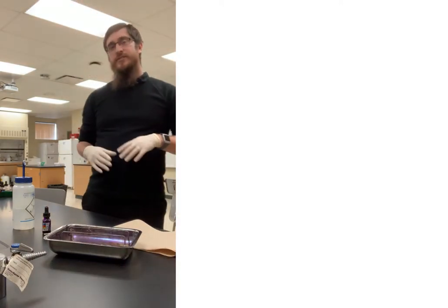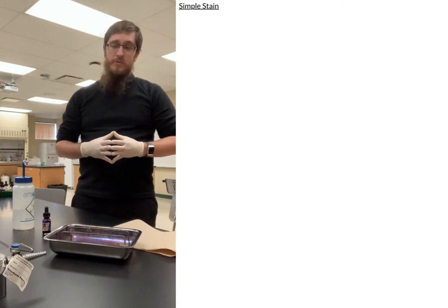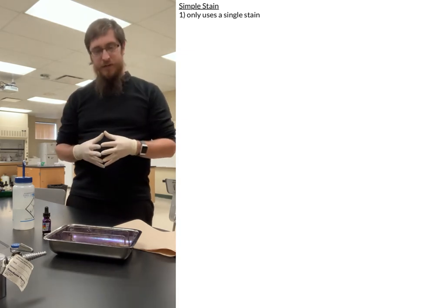Hey guys, today we're going to be talking about simple staining. The main way that we define a simple stain is that it only uses a single stain. So just keep that in mind.